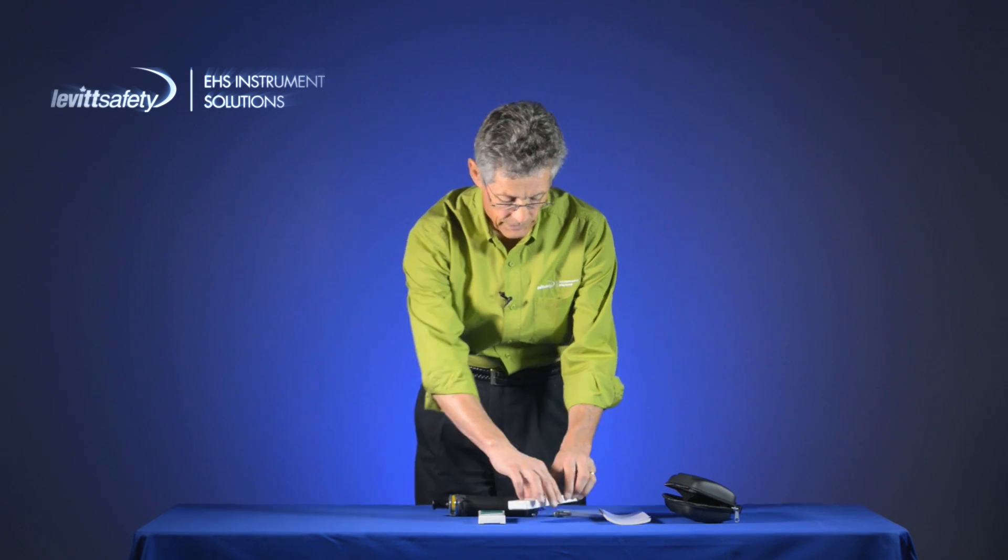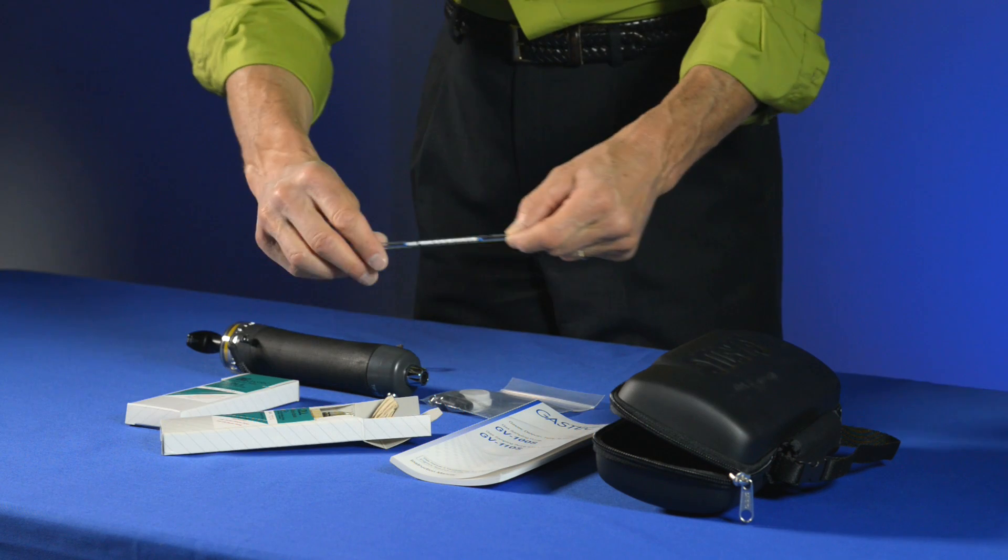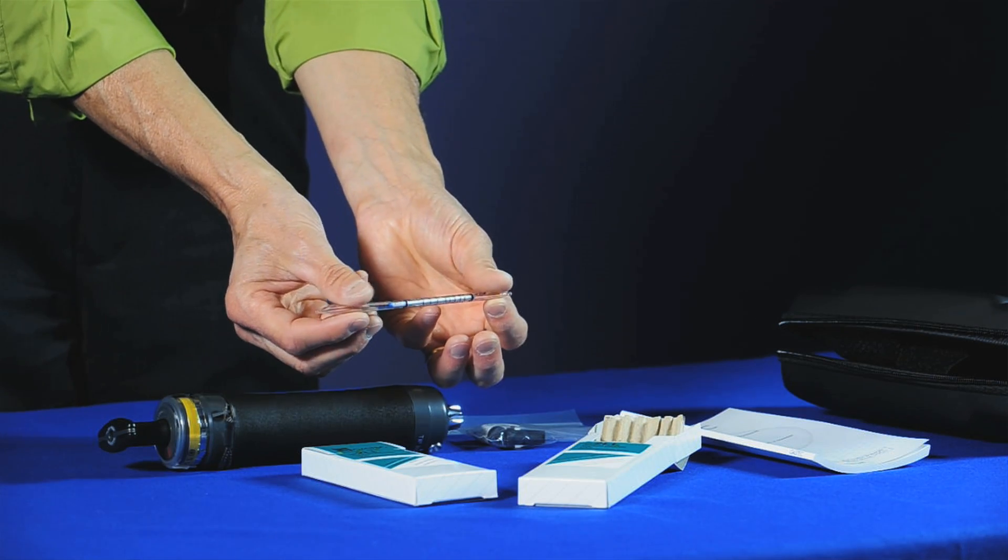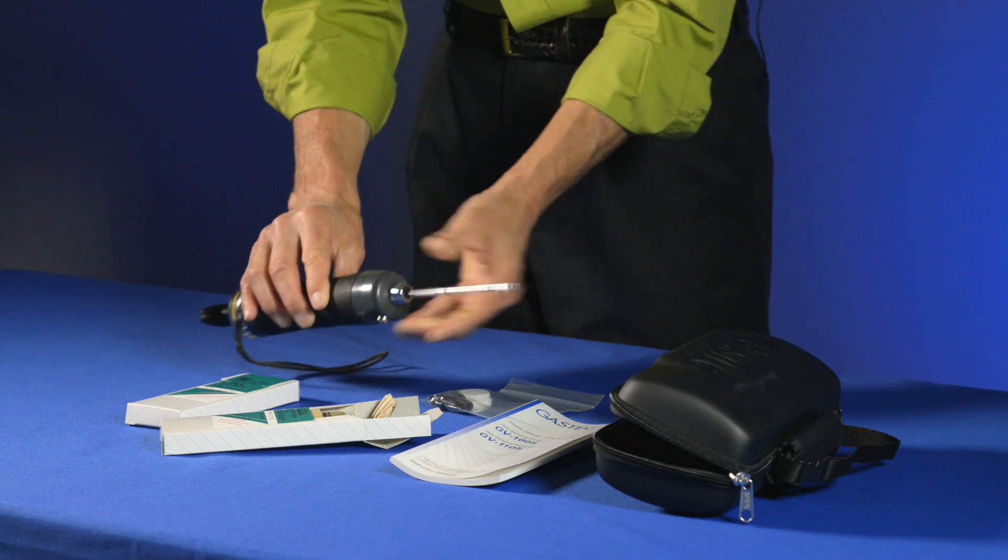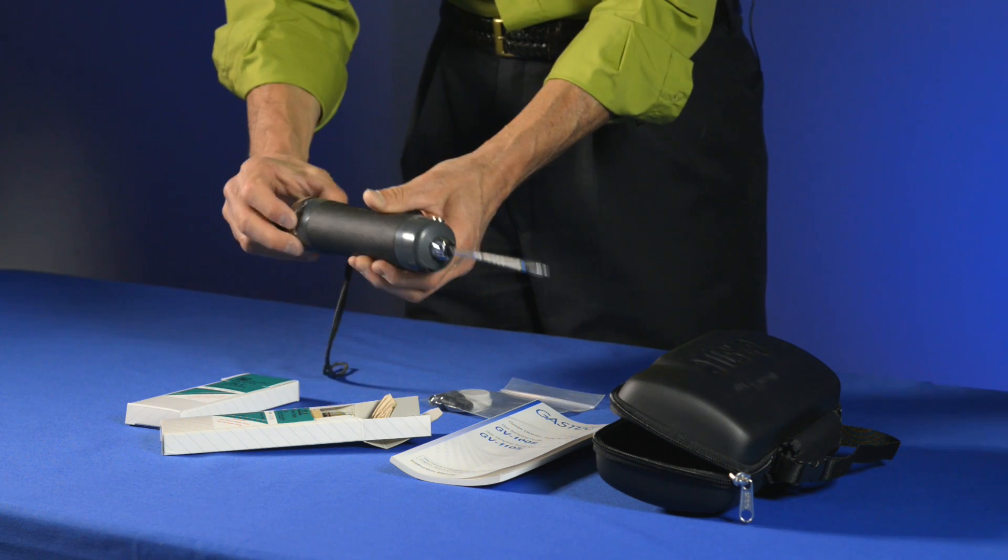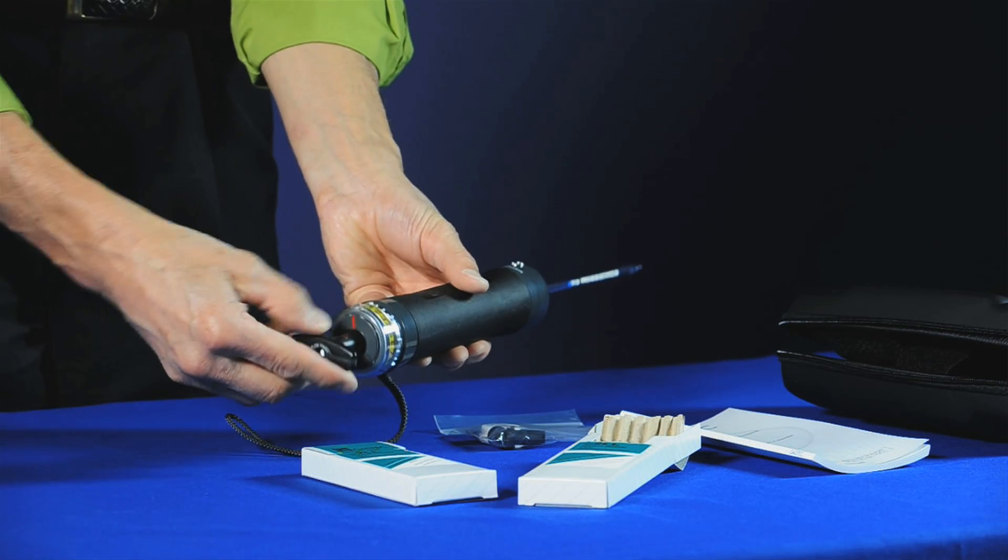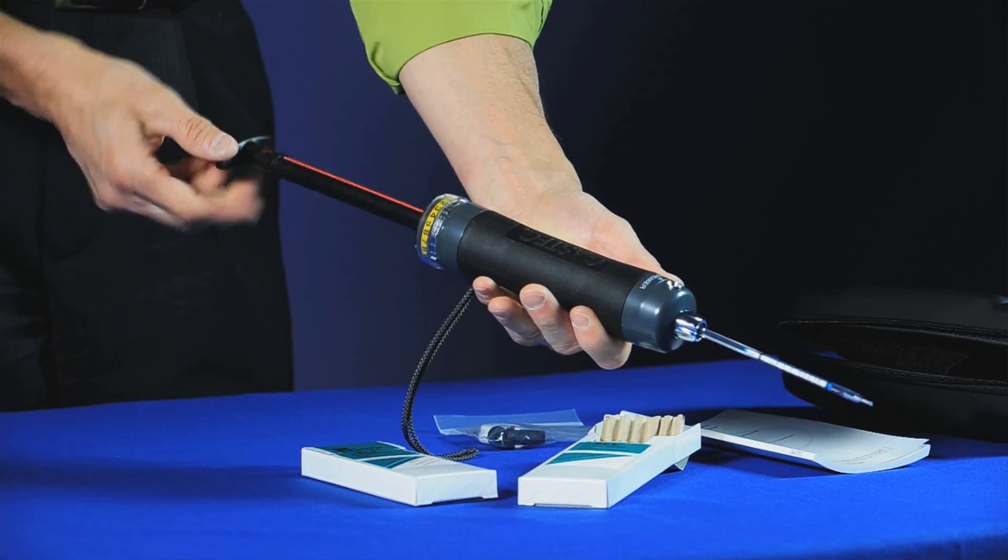There's a couple of things we have to do with detector tubes prior to use. One is to do a leak check. A leak check involves using an unbroken tube, inserting it into the front end of the pump, resetting the stroke counter, lining up the 100 cc mark and drawing out until it comes to a full click stop.